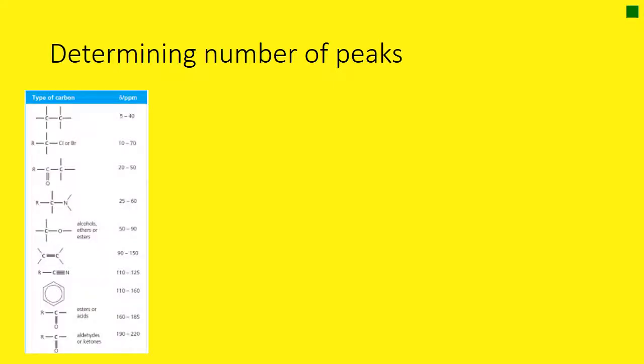And we're going to have our table to refer to, the table of chemical shifts. Notice these chemical shifts are different sort of numbers, a different scale, in the range of 5 or 10, right up to 200 or 300. But it works in the same way. So we could draw out a spectrum for a molecule here.